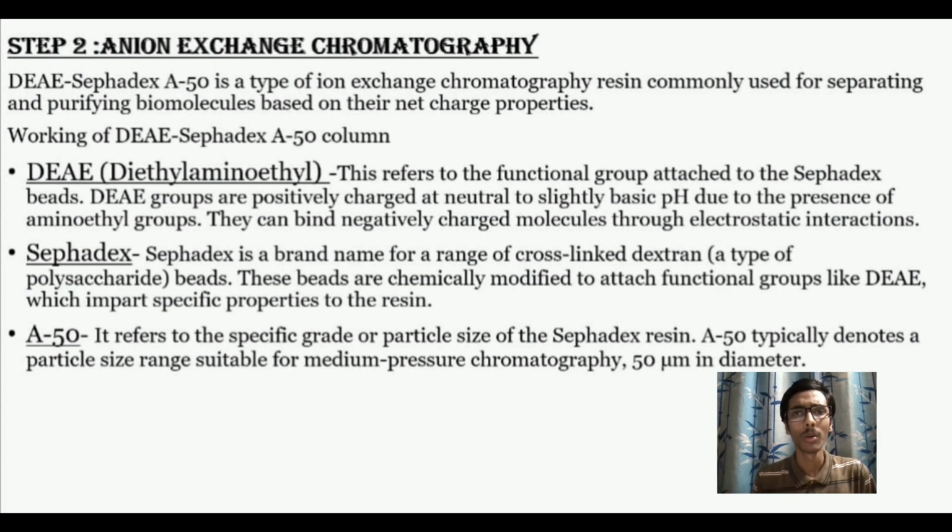DEAE is positively charged at neutral to slightly basic pH due to the presence of aminoethyl groups. Thus, it can attach to negatively charged molecules such as heparinase in our case due to the formation of electrostatic interactions.